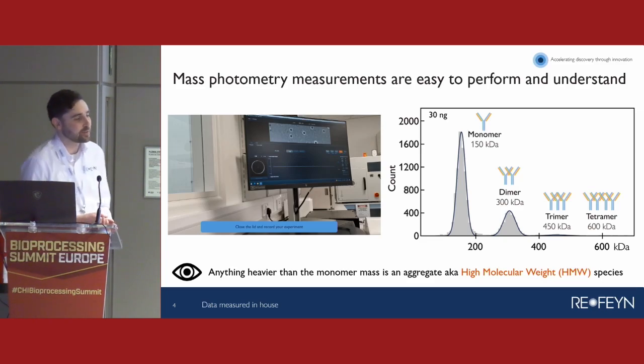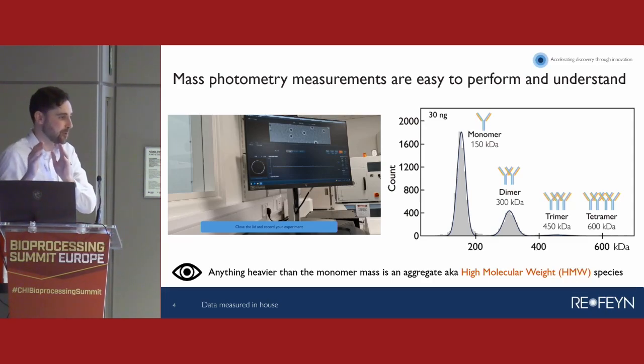So yeah, I think this just depends on a number of different factors. The molecule you're attaching and what the refractive index of that molecule is, because that will affect how heavy it appears in the mass photometry. What your average DAR is, so if you've got a large spread but with quite a lot of drug, then it will shift out more. And then the spread, so it is very much an average.